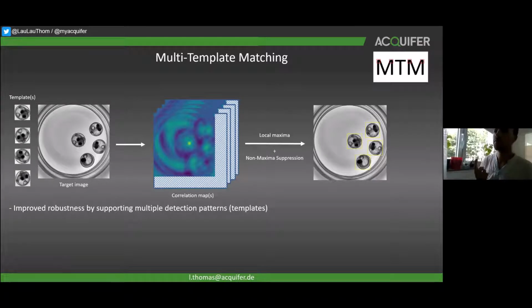of using a single template image, we can search with multiple template images, for instance, rotations of the original image. And therefore, we can increase the range of patterns that are detectable, and in turn, potentially improve the detection. And as you can see here, I just rotated my initial template 4 times by 90 degrees every time, and this was already enough to localize the embryos correctly.